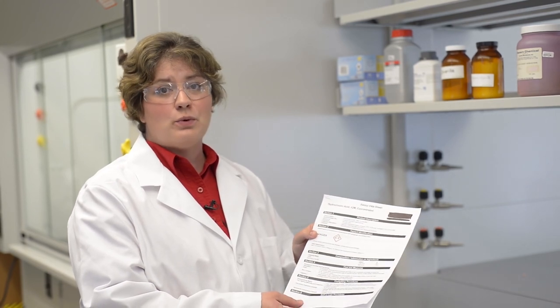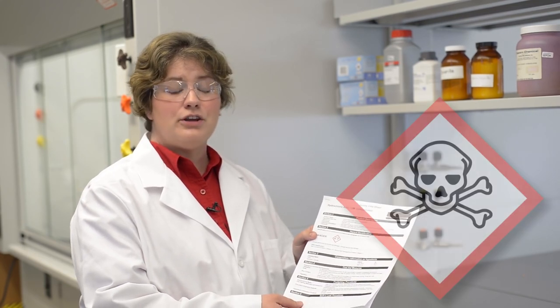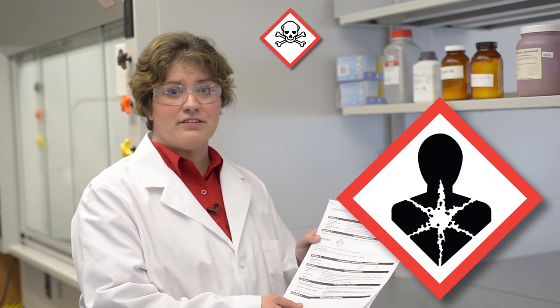Safety data sheets will also contain these pictures, which will indicate the health hazards or the hazards associated with each chemical. The most common ones include acute toxins, long-term health hazards, oxidizers, gases under pressure, and corrosives.